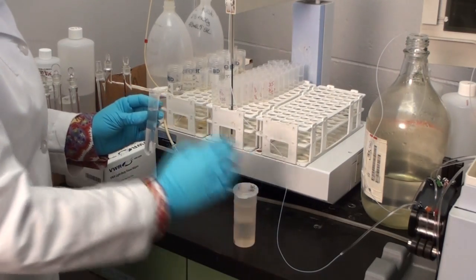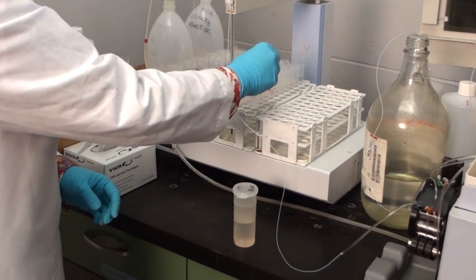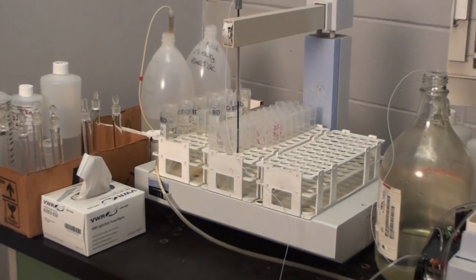At this point, the sample is absorbed up through peristaltic pumps into what is called the argon torch of the instrument. This is where the chemistry actually takes place.